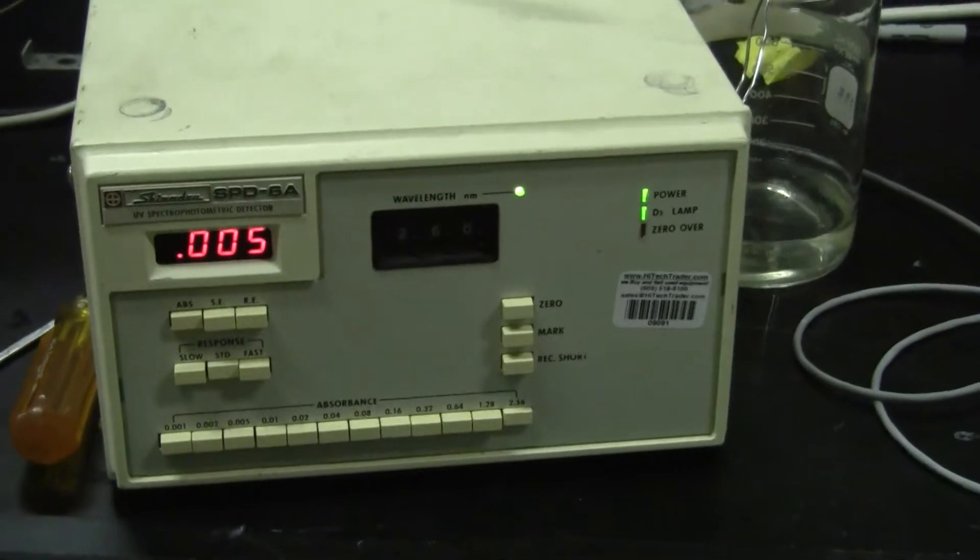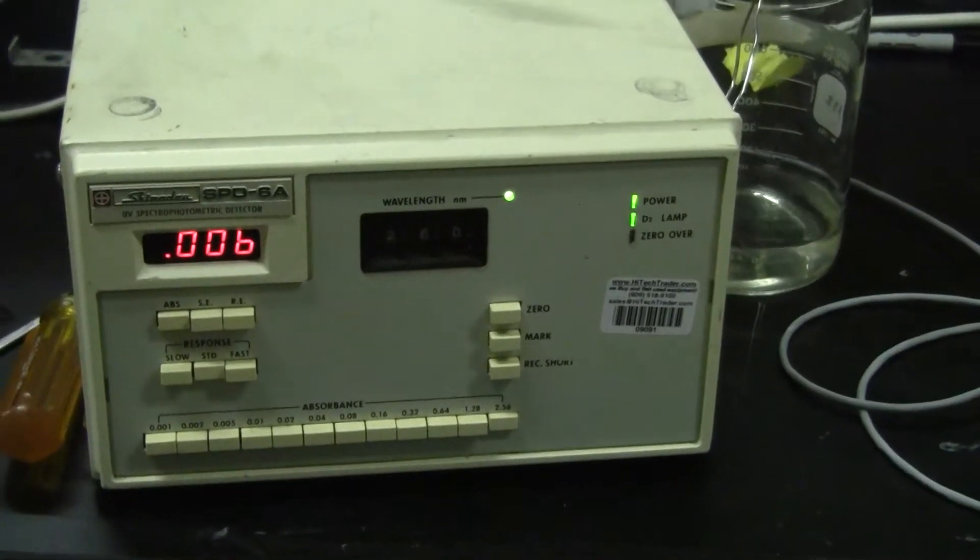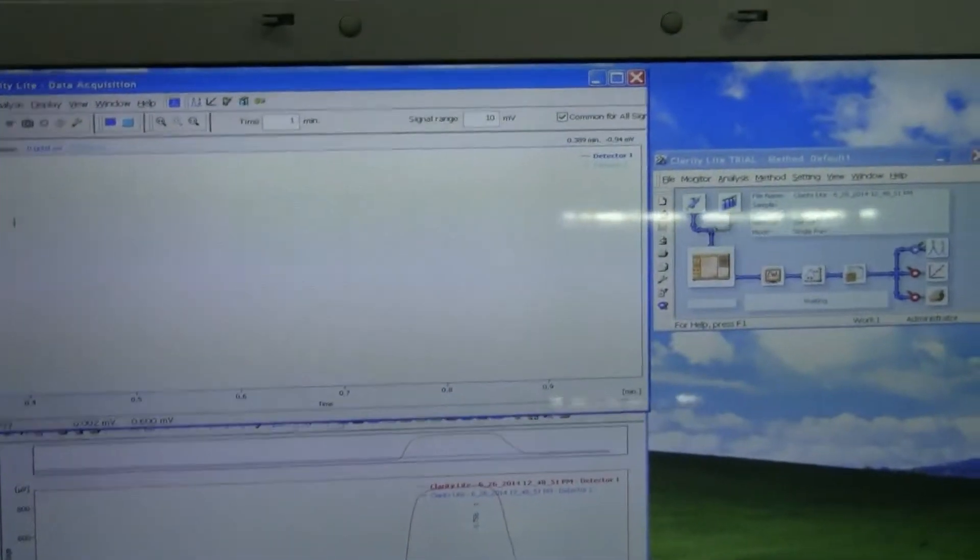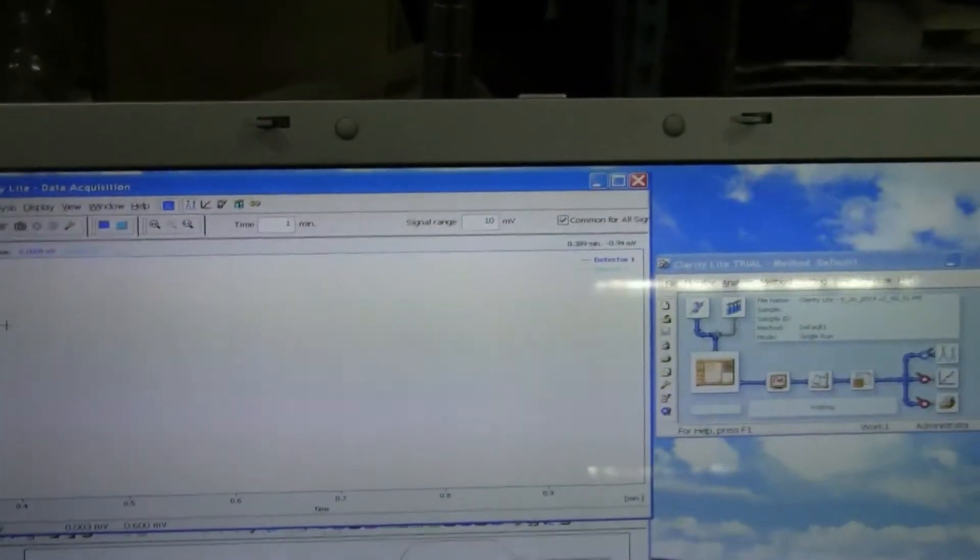This is a classical piece. However, what we're doing is we're actually taking the output signal and sending it to a computer. This is Clarity Lite, a data acquisition software.